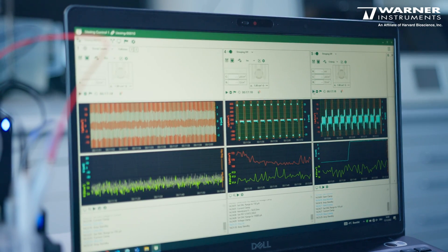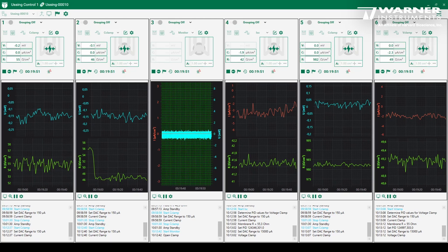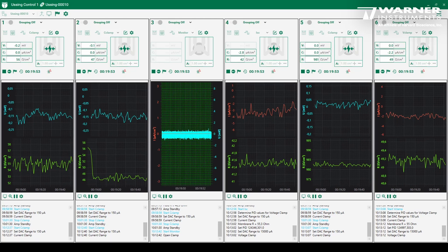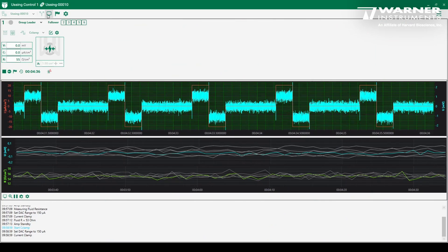Something else that makes Smart Ussing different is its software — it's much easier to use than most data acquisition software. You can see the data of each individual amplifier separately, or you can see combined views of parallel experiments.